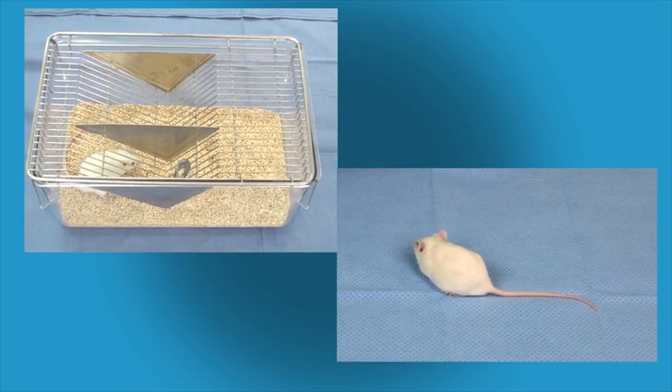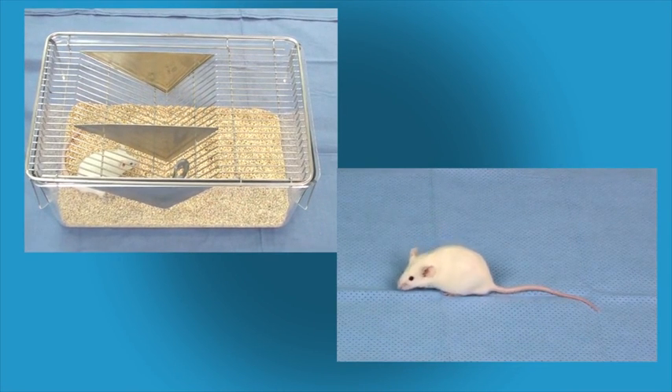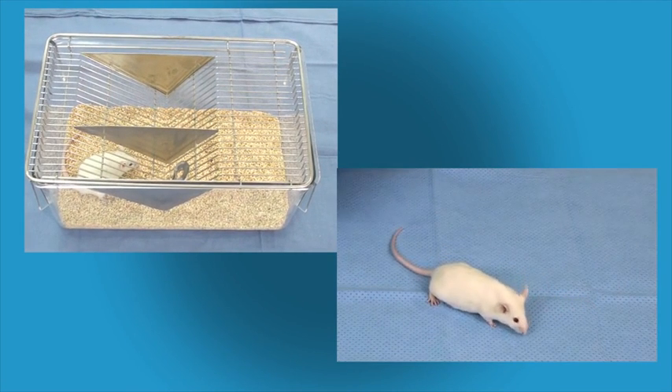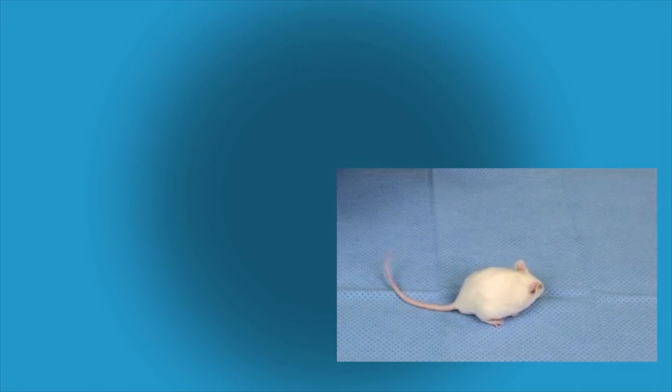Prior to gavaging, make sure to observe the animal in and outside of its cage, not only to detect any abnormalities in behavior or physical status, but also to note normal respiratory rate and effort. The same observations should be made after gavaging to make sure there were no significant changes resulting from the procedure.